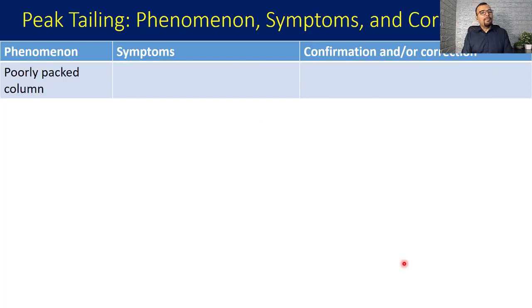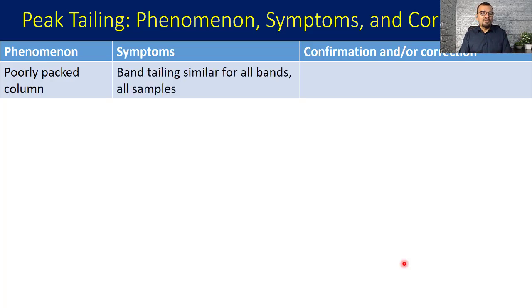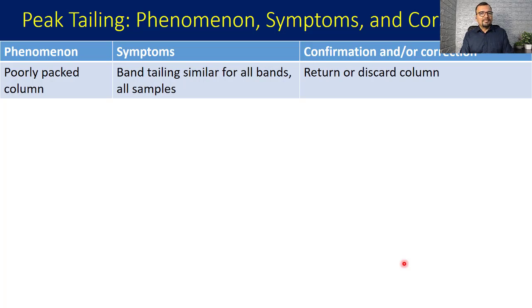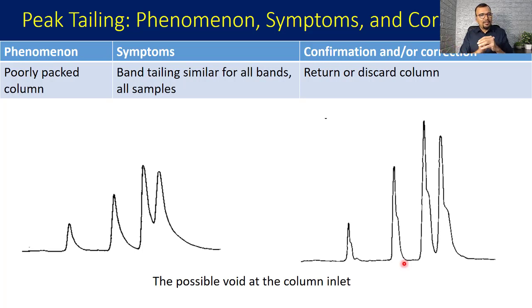A poorly packed column is important to consider — properly packed columns are required to get symmetric peaks. If your column is not properly packed, it can result in peak tailing or peak distortion. The symptom is that band tailing is similar for all bands across all samples — for both early-eluting and late-eluting peaks you will see a similar kind of tailing pattern. If the column has been found to be bad, you cannot use it for further analysis; you must return it or discard it.